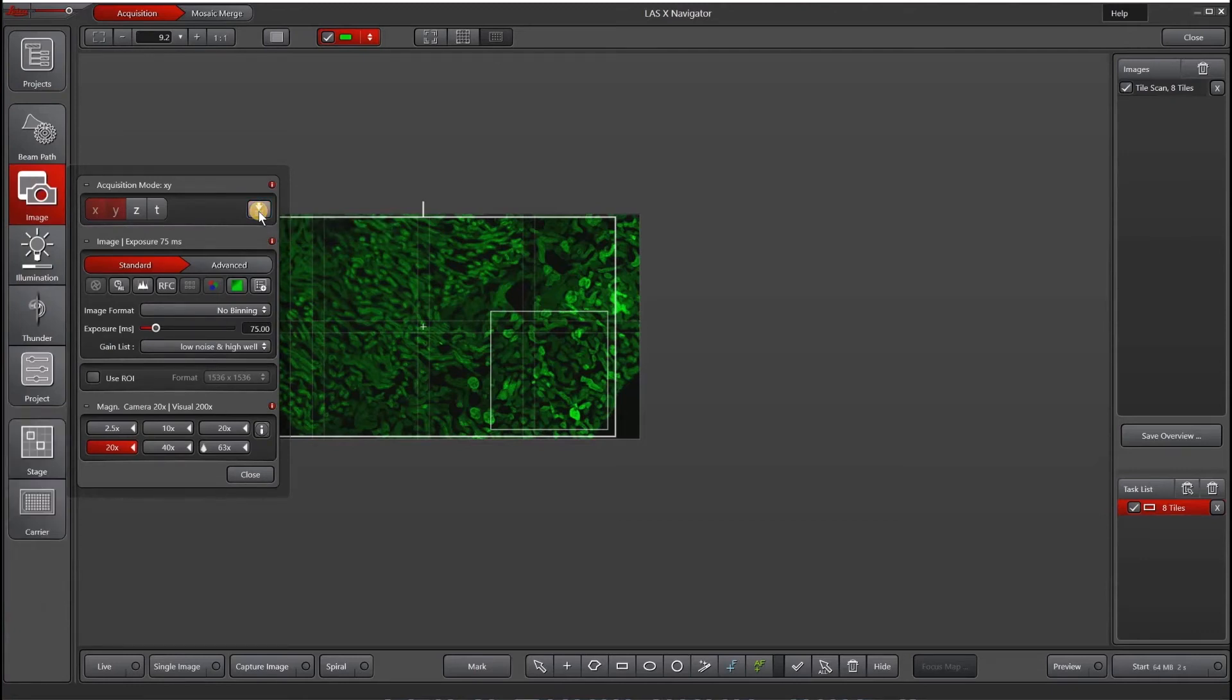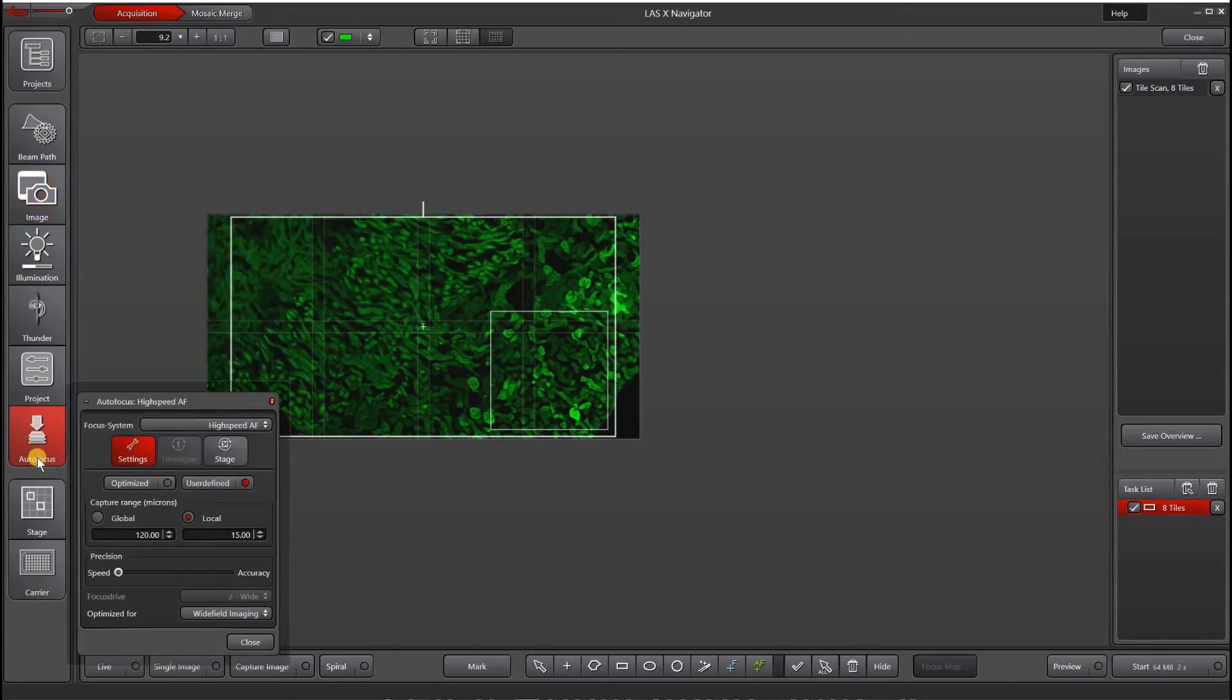When I toggle this, it goes off, and then when I toggle it, it's red, it comes back on, and then I have this autofocus panel on the left side.